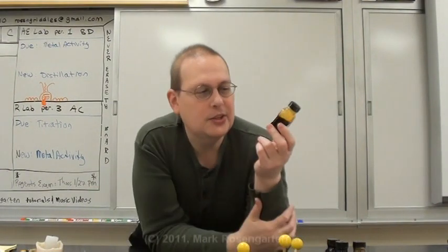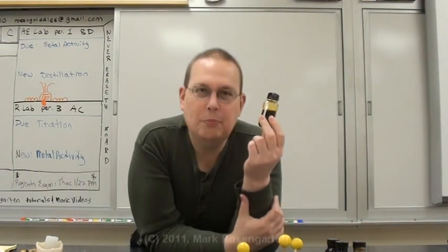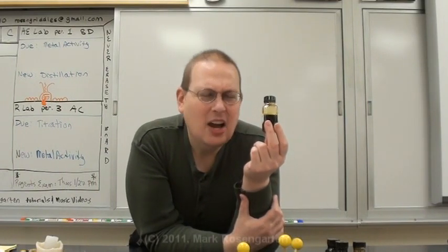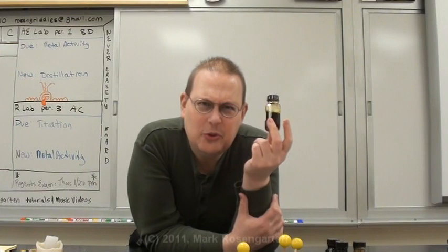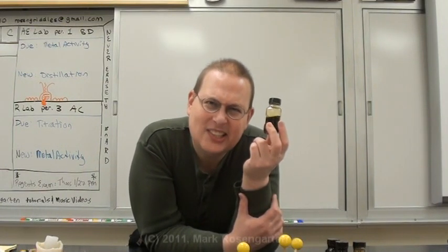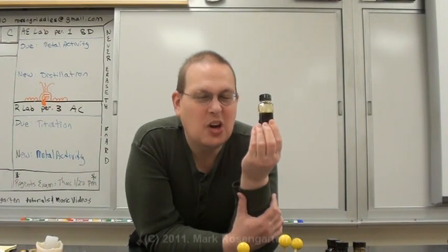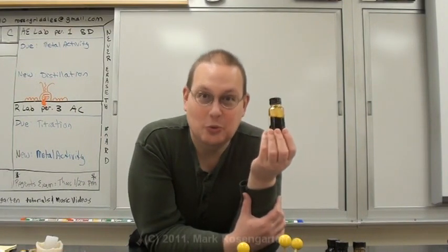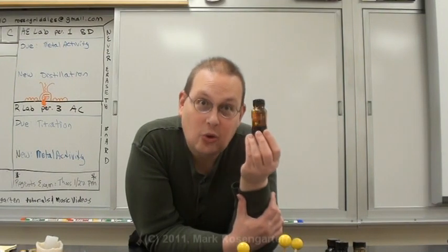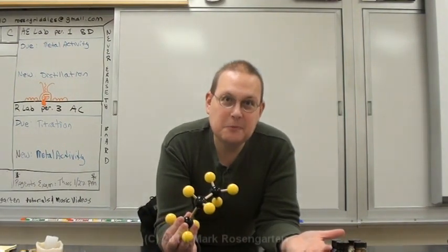You get all different kinds of molecules out of this. You get the molecules that are used to make propane, butane, gasoline, plastics, home heating oil, jet fuel, kerosene, lubricating oils, waxes, greases, everything to the tar that's used in asphalt and also roofing shingles. There's a lot of things you can get out of crude oil. So how do we separate out these components?